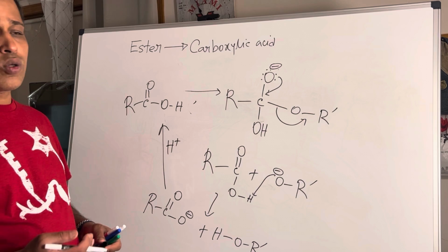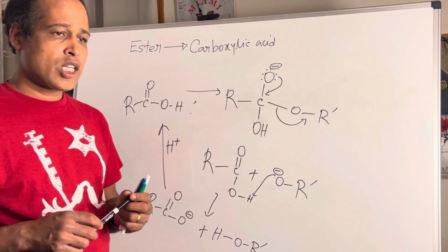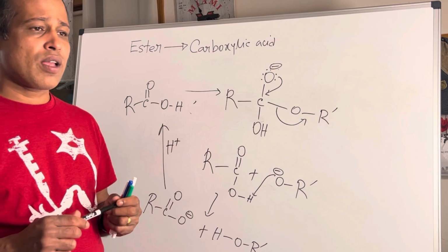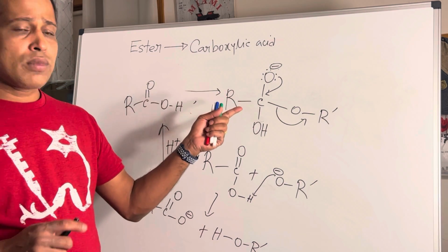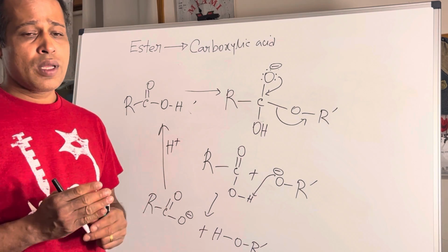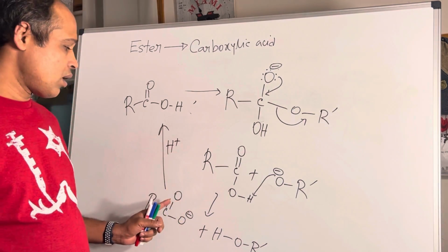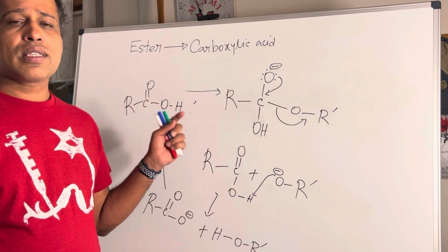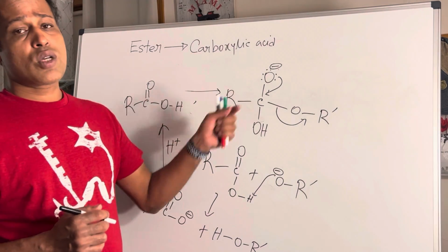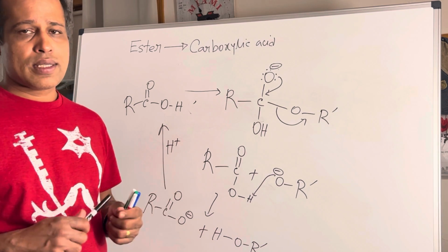Also sometimes people use acid to do the saponification. Why is the name saponification? Because soap is actually made from ester, triglyceride ester, like fatty ester, by using sodium hydroxide, with a similar mechanism. That forms the salt of the long chain aliphatic acid, and the glycerin as a side product, the alcohol part. That long chain carboxylic acid reacts with sodium hydroxide to form its sodium salt. Since that process is the same as this ester to carboxylic acid conversion, it is called saponification. That means you can make soap from the same reaction.